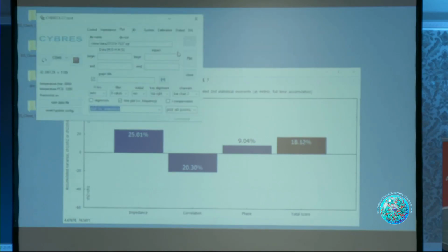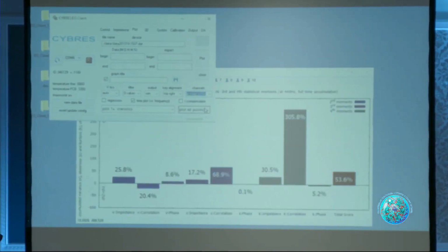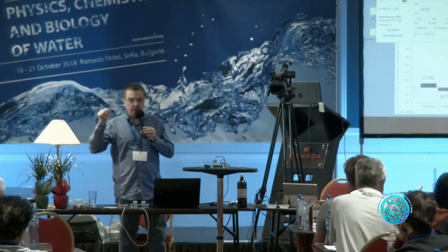Yeah? And we can, of course, put more characterization. We can, for instance, go into more detail. What are, for instance, specific peaks? We can explore dynamical aspects. We can change frequency, you see now we have multiple parameters. We go through the scanning frequency of impedance spectroscopy and go through spectra.